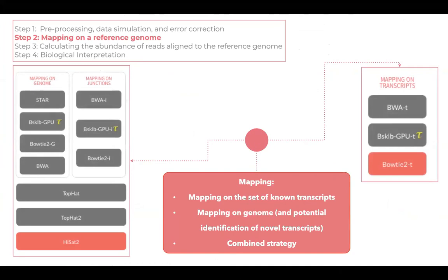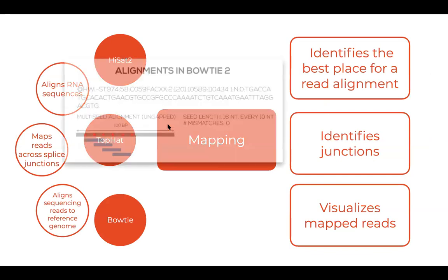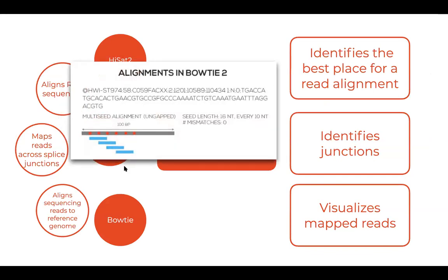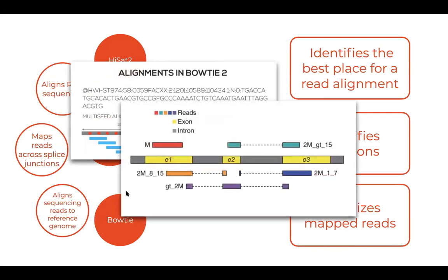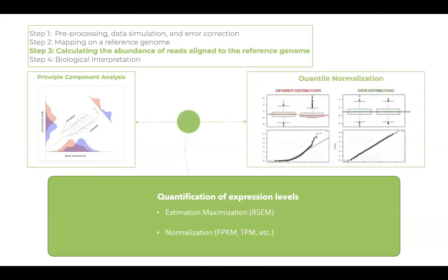Now, a simple way to test whether you are familiar with the different names and the different meanings of these algorithms is to try and run some comparisons. You can take a look at the same data set being processed with multiple methods. As we go into the project and you identify a data set, you might want to explore how variation in the different algorithms plays a role in how this data could be quantified and measured, ultimately producing a table of expression. So this quantification of levels of expression is a very important step.